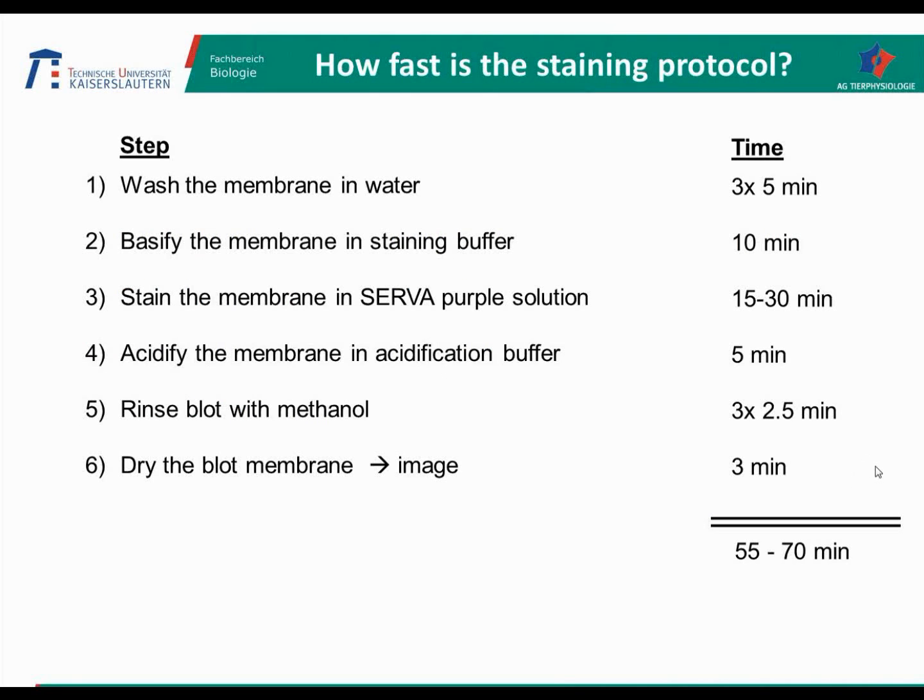Before I summarize my points, I would like to give you an overview. Maybe you wonder how fast the staining protocol is. Maybe up to now you only did housekeeping proteins as a loading control, and how fast is it? Is this maybe a disadvantage? I just looked up the SERVA homepage and took the SERVA Purple variant, which is the newest one. That's why I chose this, and the times that are recommended there.